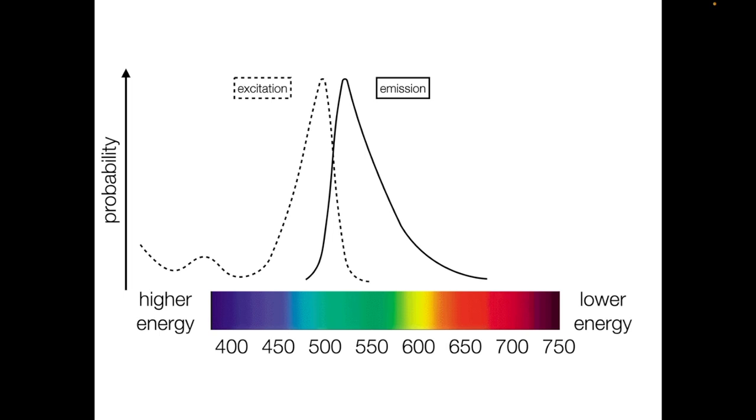You'll often see a fluorophore described by its excitation and emission maxima. These are the peaks of each spectrum, corresponding to the wavelength that most efficiently excites the fluorophore and the wavelength it's most likely to emit. The Stokes shift is the difference between these two wavelengths. While the maxima are useful numbers to know, it's important to be familiar with the full spectrum of the fluorophores you use, since spectra can vary quite a bit in shape.